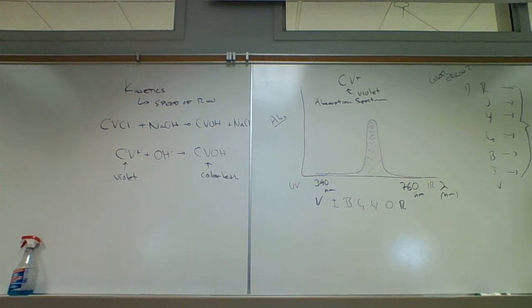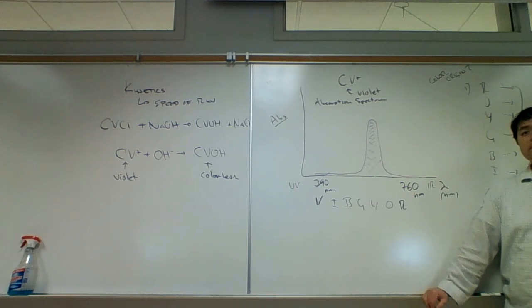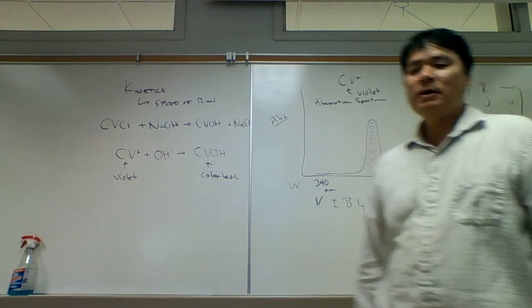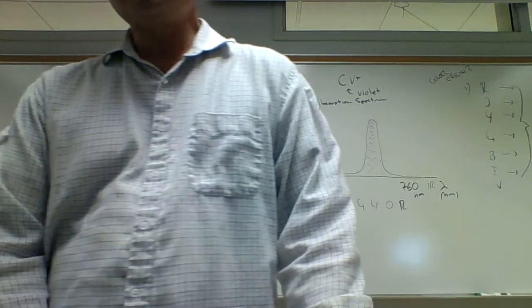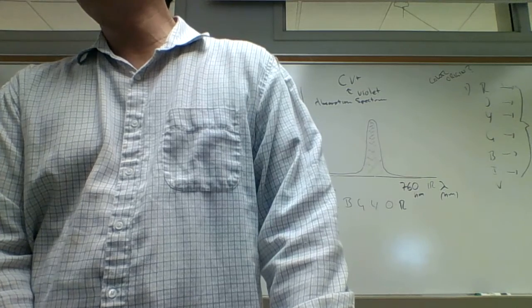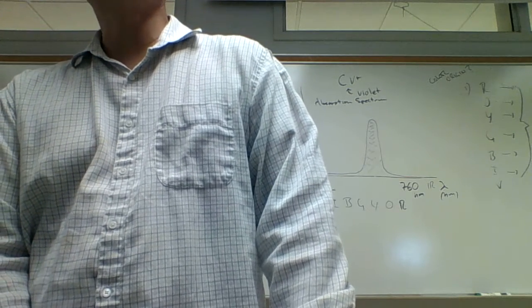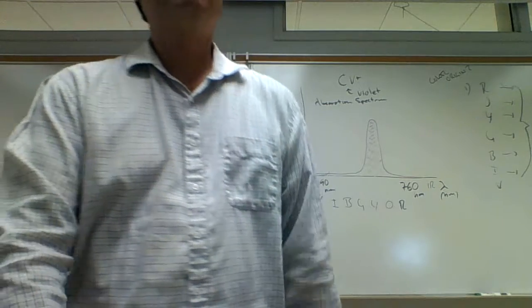And so the first thing we need to do is we just need to see what is the origin of the color in crystal violet? All right, so I'm going to stop here because today's lab, we're going to do it in parts. And so why don't you check out the equipment, and the first part is we're going to determine the spectrum of crystal violet.